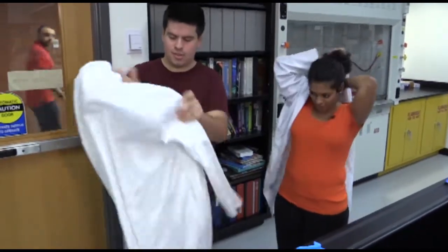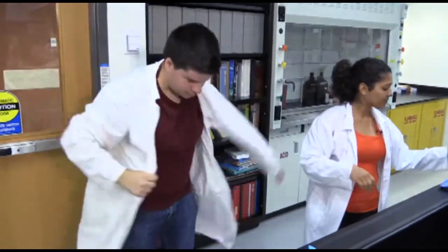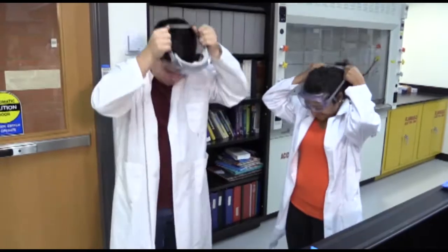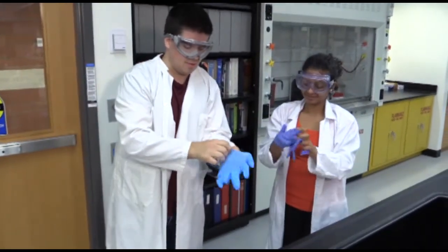Lab coat? Lab coat. Goggles? Goggles. Gloves? Gloves.